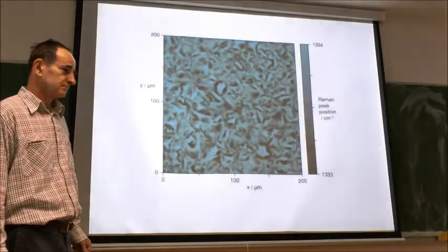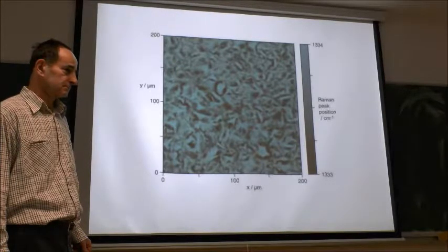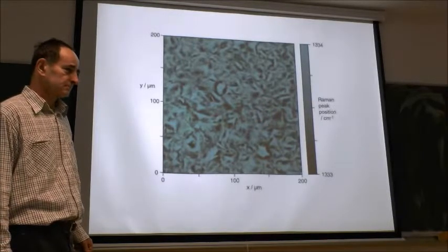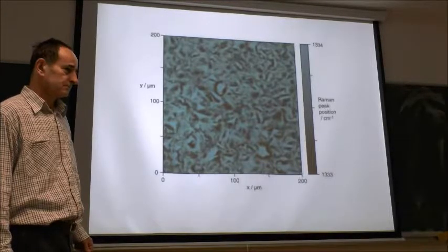So actually the resolution problem is due to the spot of the laser, not due to the moving of the stage. Yes. Suppose what's the spot size? I guess this half a micron is just the step in the stage movement, as I understood. Is it true?